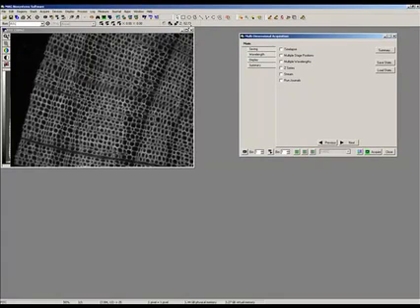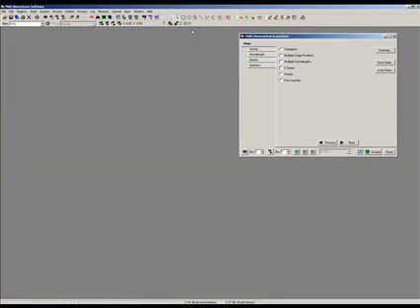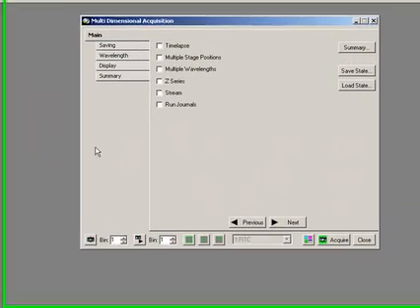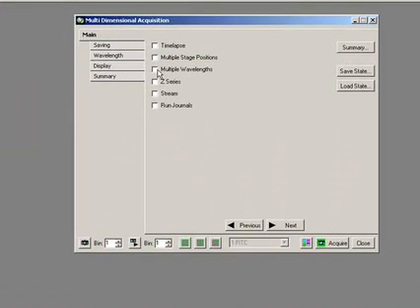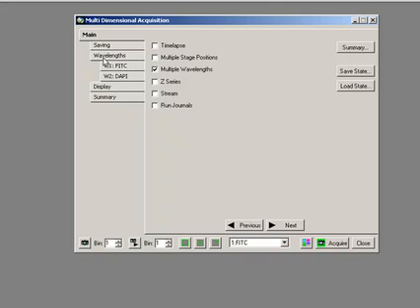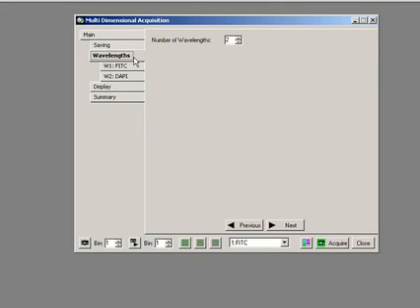Okay, so let's combine this. Let's try and do a multiple-channel experiment. If I click multiple wavelengths, you can see my tab grows. So under Wavelength, I now have two tabs, W1 and W2. If I go back to Wavelengths tab where I was previously controlling the camera, we can see it doesn't have any of that information anymore. It simply says how many wavelengths.